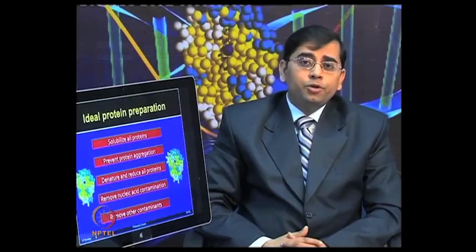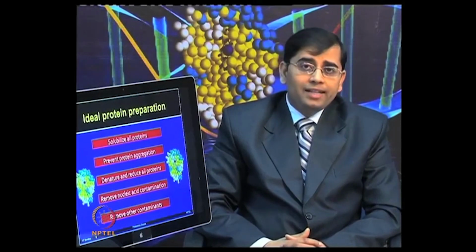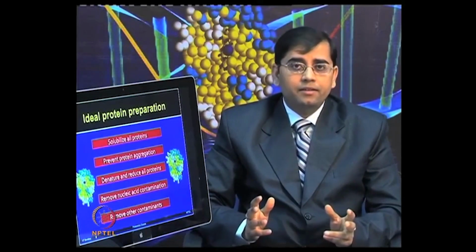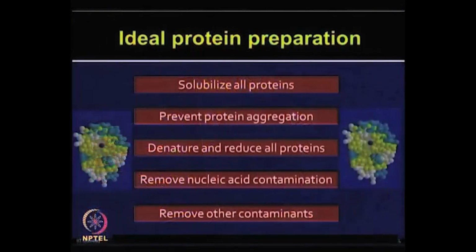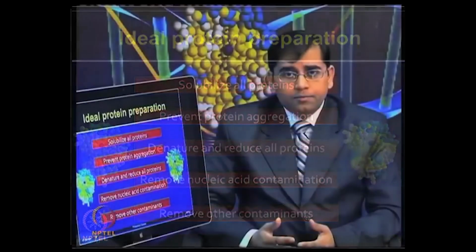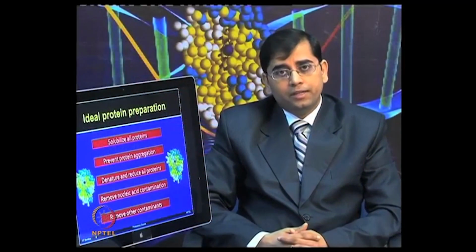So, an ideal protein preparation involves solubilizing all the proteins present in a given mixture, preventing protein aggregation, denaturing and reducing all the proteins which are present in that mixture, removal of nucleic acid and other contaminants, as well as removing salt and some other small interfering components.